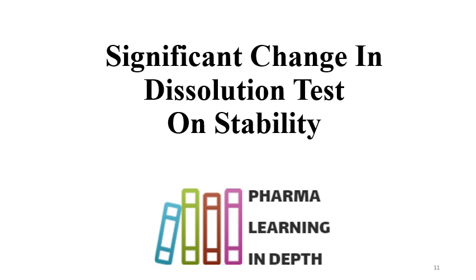Also, whenever you are performing stability studies, load the stability samples in different packs, in higher packs and lower packs, like the most protective packs and the least protective packs, so that you can bracket the medium packs, and then you can have a prediction for the dissolution failure or dissolution testing on the stability samples.